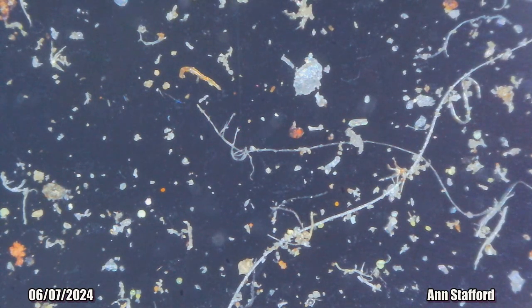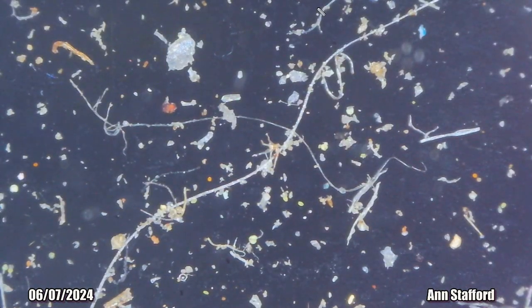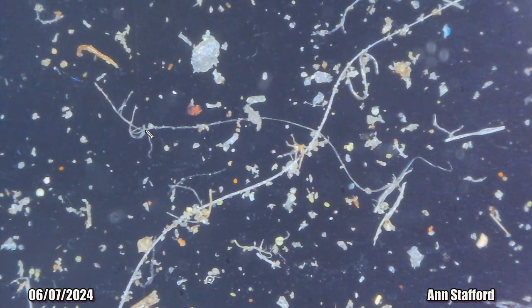The little Y? And this appears to be where the head would be. And it's just got a really extremely long tentacle. I don't know what you would even call it. It's not as long as this one, but it's a really good example for what I was just showing. You can see for yourself that these things are growing, and there's little buds. There's little places where I feel sure more of these are going to grow.